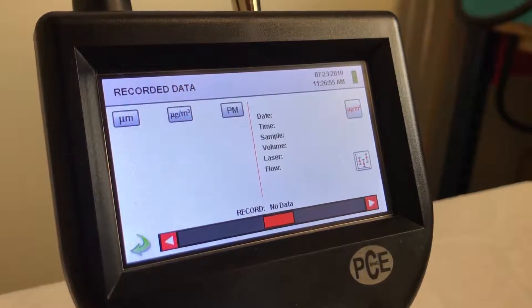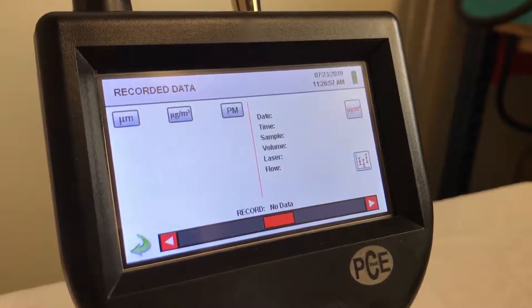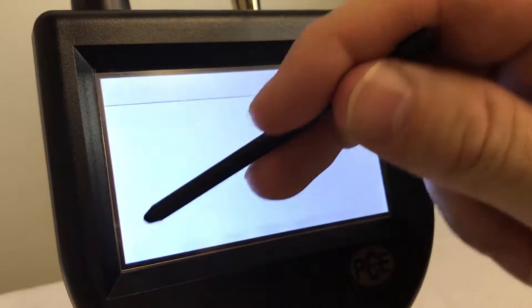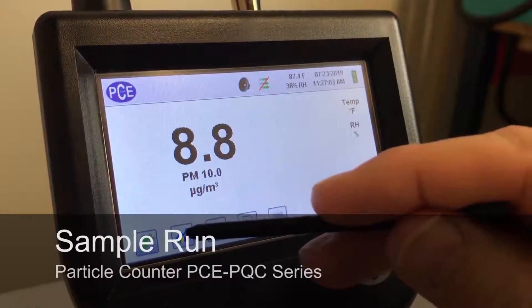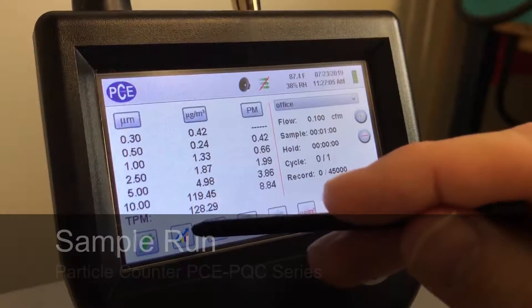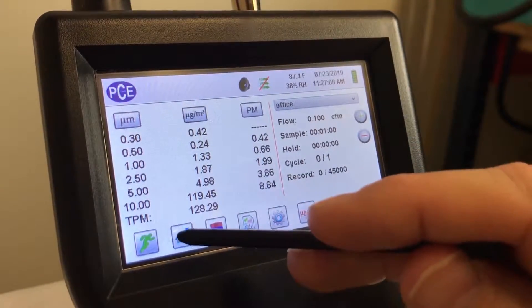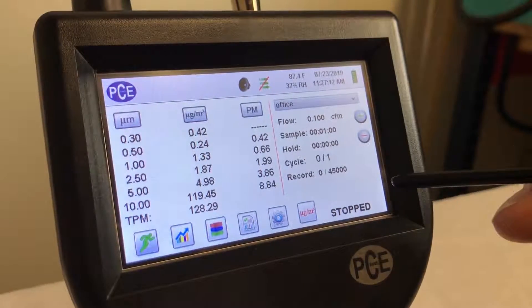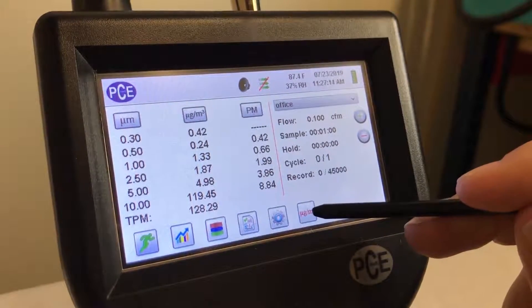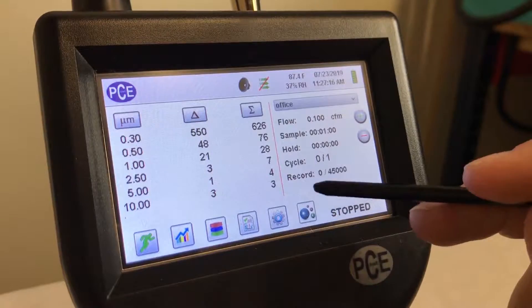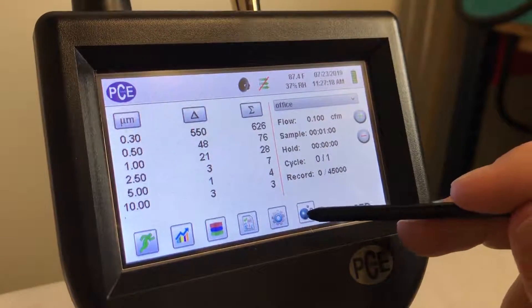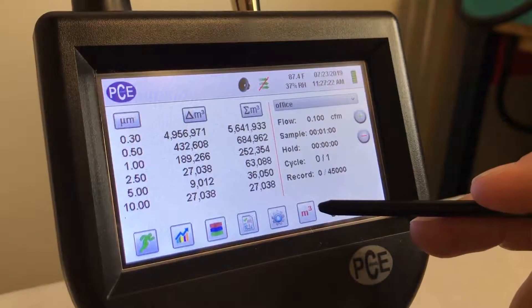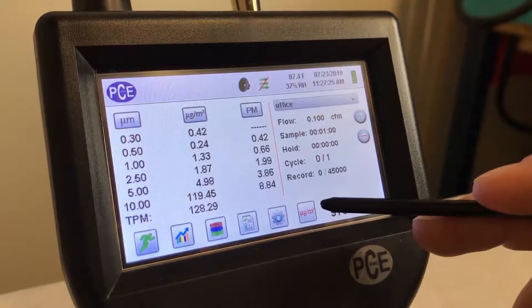Once you make a recorded sample, all the data will be displayed on this screen. And this is what the screen looks like when you're actually running a sample. You can toggle through from cumulative and differential, cubic feet, cubic meter, and your PM.